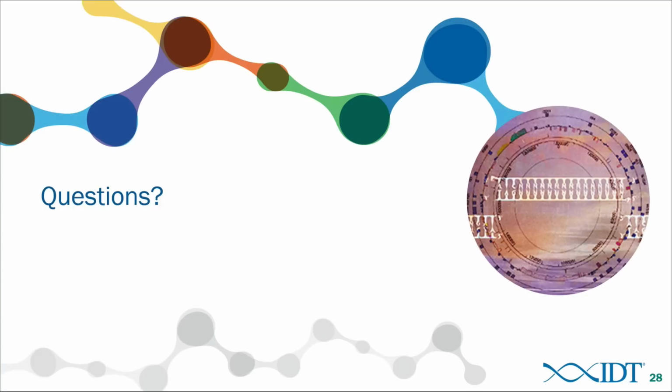And I'm actually going to ask a related thing. I'm going to jump ahead here just a little bit. When you were talking about what we allow people to enter into the ordering tool, how does a person know when to choose a 19 base pair target or a 20 base pair target for their crRNA? Is there a reason to choose 19?